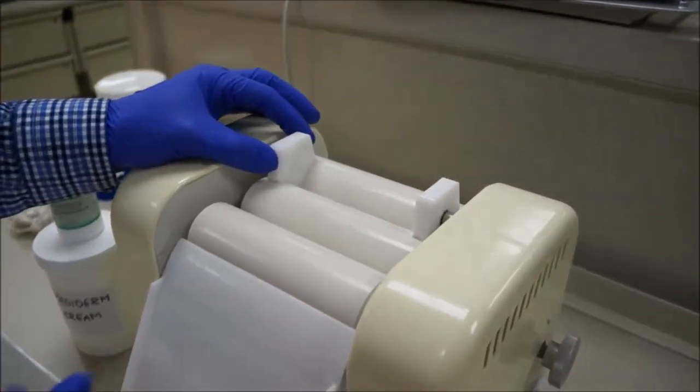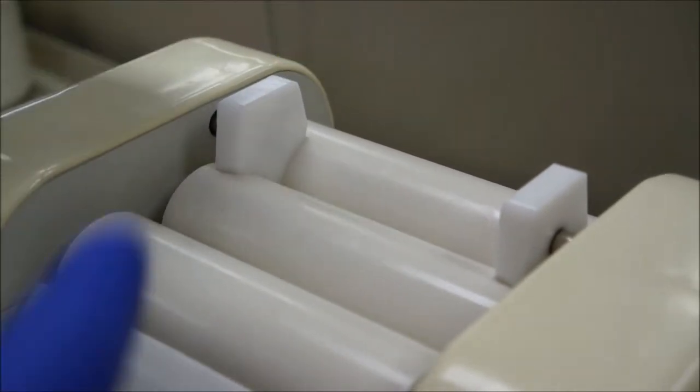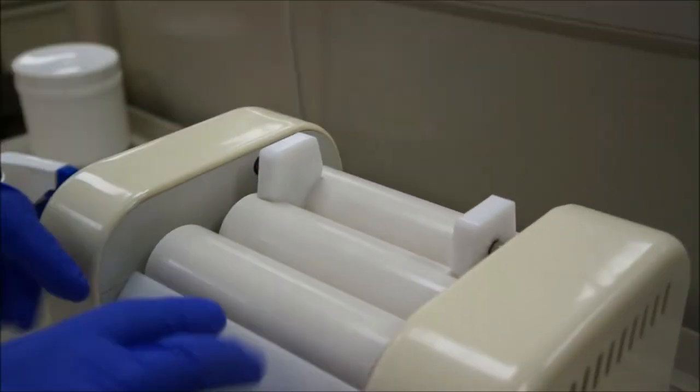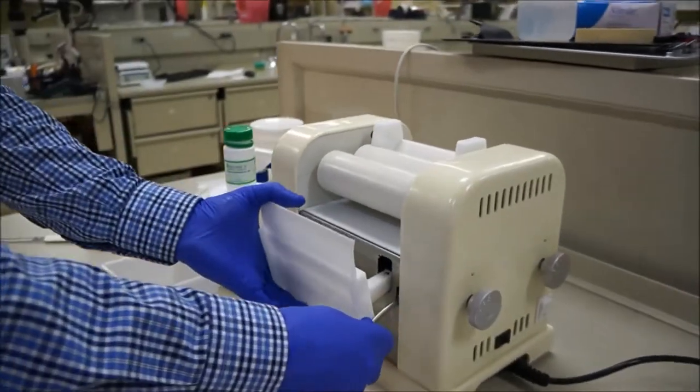On top here we have two spacers where you would put your ointment or cream that way you would run through the machine. It would go down, come up and hit this scraper plate and come down. The scraper plate's removable so you can wash it and get everything off of it.